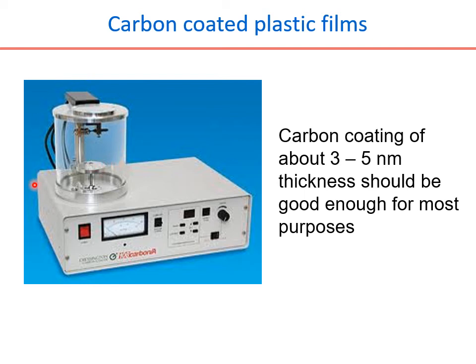Most of the time the carbon coater and the glow discharger will come as a package. So in the same instrument both will be accommodated. The only thing is these electrodes will be replaced with a ring here for the glow discharge experiment, and that ring will be replaced back with the electrodes for the carbon coater. So the same setup will be used for either the glow discharger or the carbon coater.